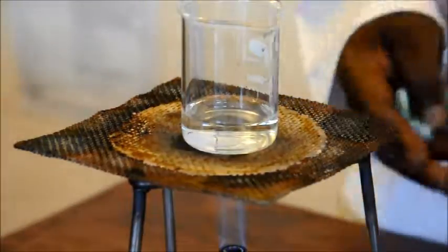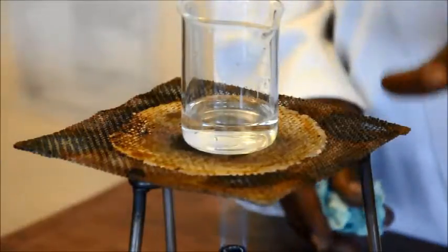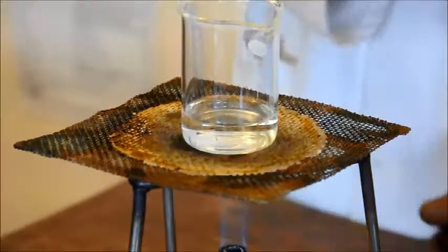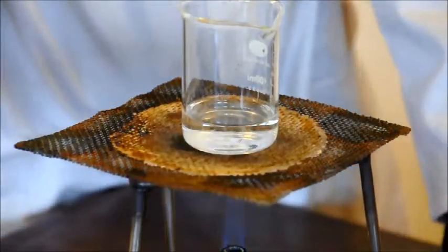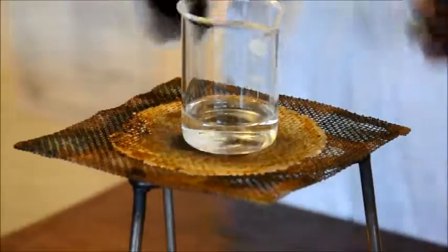I've been warming this acid here for approximately 2 minutes, and it's nowhere near boiling yet, but I think that it's warm enough to be able to react. So that being the case, I'll turn off the gas, remove the Bunsen burner, and now I'm ready to add the copper oxide.